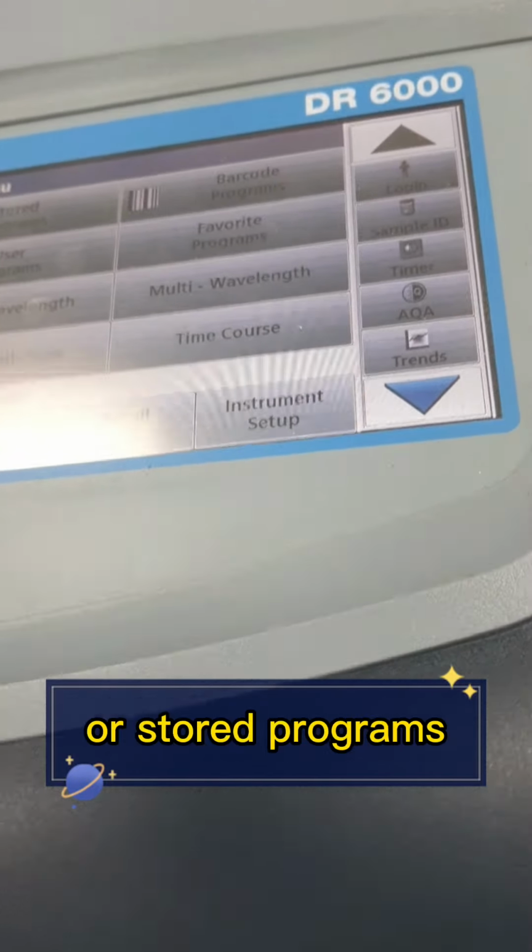So we are going to find out ions as well as alkalinity, and all these ions determination can be done by colorimetric methods, using Hach barcoded kits, or you can say using a UV visible spectrophotometer. Especially these ions can also be done by IC, ion chromatography. Okay, not ICP-OES or ICP-MS. Okay, so now we'll be starting.